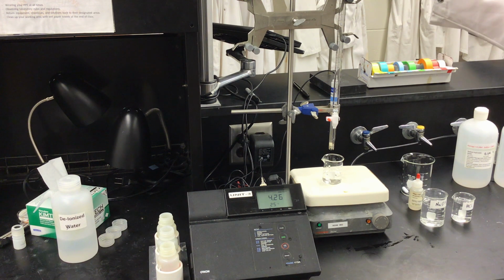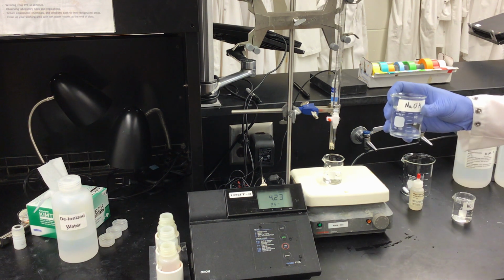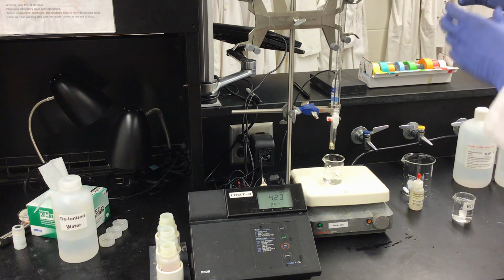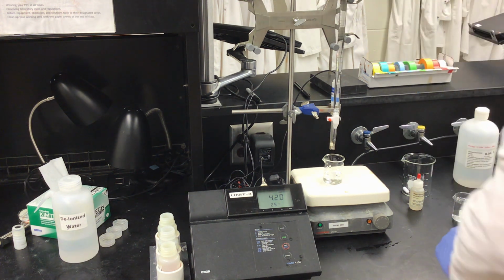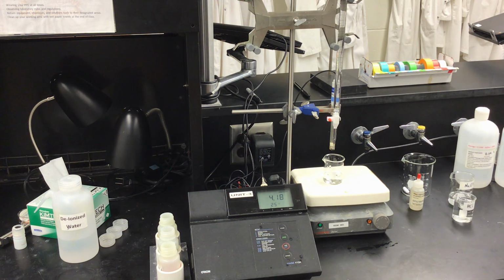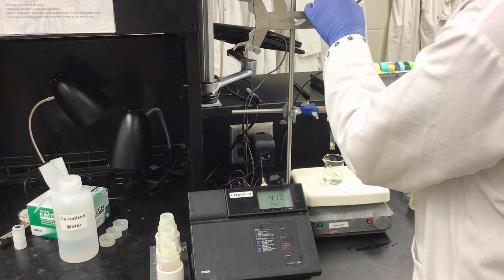I have my 50 milliliter burette here. I have already rinsed it and washed it, as you can see from the video prior. Now I will take my base, sodium hydroxide, and fill it. I have my funnel up top here. Now I need to go back through and make sure that there are no air bubbles in it, and also to top it off to our 0 mark.